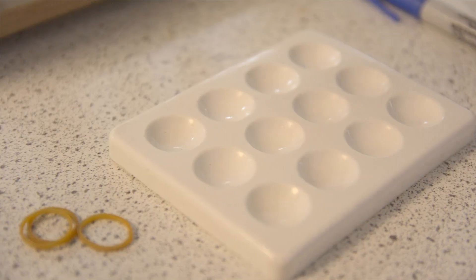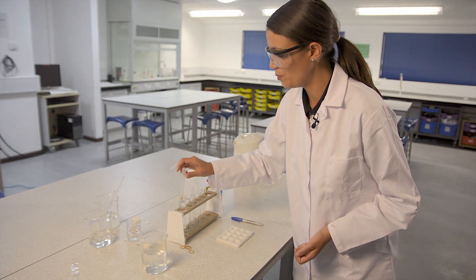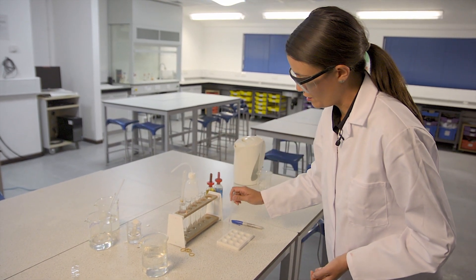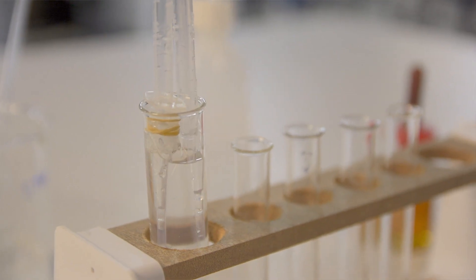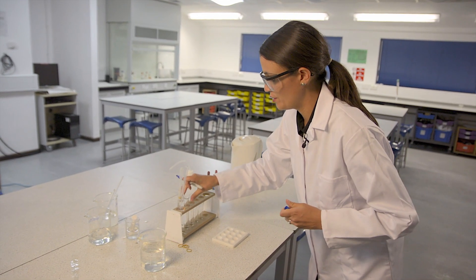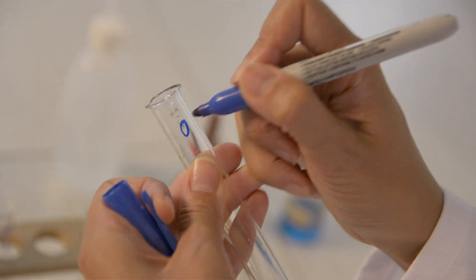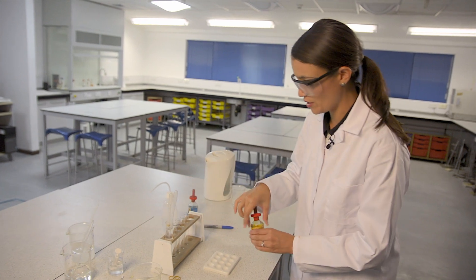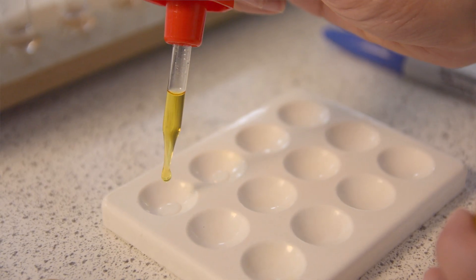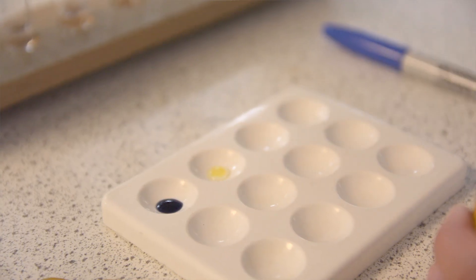With the first sample from inside the visking tubing, I'm going to place a drop on my tile. The same with the sample from outside the tubing. In order to test for the presence of starch, I'm just going to add a drop of iodine to each. From the sample inside the visking tubing, we can see that starch is present as we'd expected. And from the sample outside the visking tubing, we can see that there's no starch.